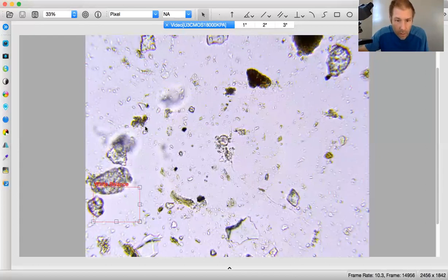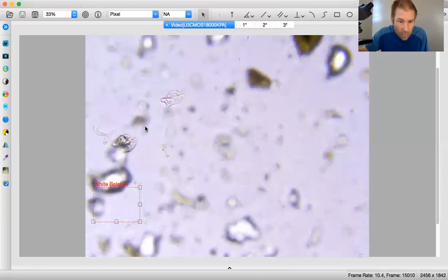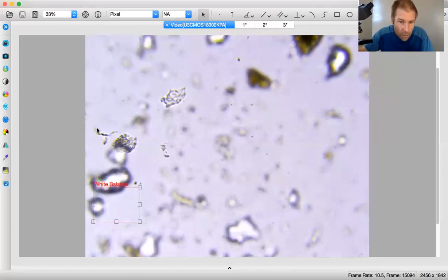Let me go to the top of the column. Oop, what do we got? Almost missed that, except, nope, that has a fat end to it right here. And I mean, that could be filament. That is much larger here than it is here.